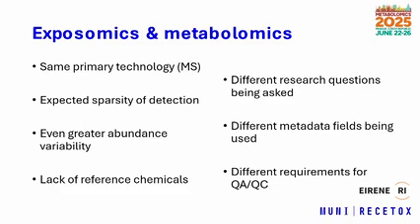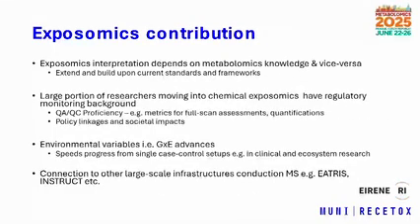And that means we often have to interact with a lot of chemoinformatics, a lot of in silico work to promote that. So we're doing things from a different side. This is because we're inherently asking different research questions, and that also has knock-on effects where we place importance and emphasis on different metadata fields. We also have very different requirements on QA/QC, and we do not wish to be completely isolated and span off. As a research infrastructure, we have a large community asking for support, and I do not wish to repeat the decades of work that have gone on in other fields, so this is where we branched out.